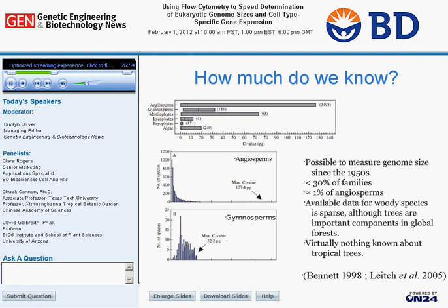So just a few things that we do know about plant genome sizes. Even though we've been able to measure genome sizes for over 50 years now, we still don't know the genome sizes of more than 99% of angiosperm species. You can see at the top graph there's a very wide range in angiosperm genome sizes, and the figures A and B show angiosperms and gymnosperms. Although there are a few examples of very large genome sizes in angiosperms, most of them are much smaller than the typical gymnosperm. You might have heard stories about the massive genomes that pines have, but we don't have as much of that in angiosperms, or flowering plants, as you do in gymnosperms. But still, we don't really know that much about genome size in general.